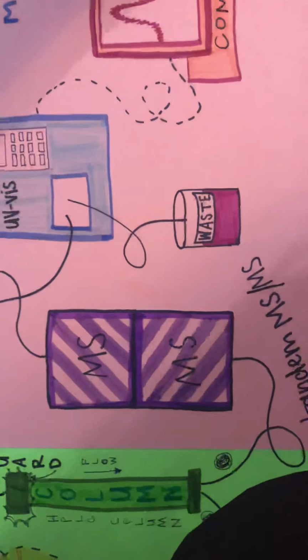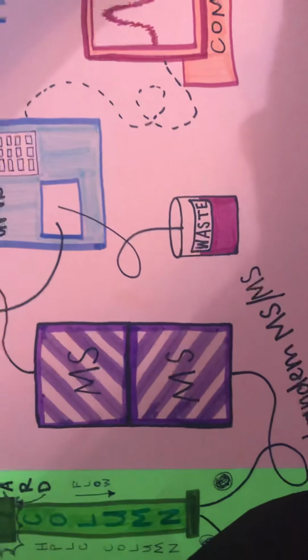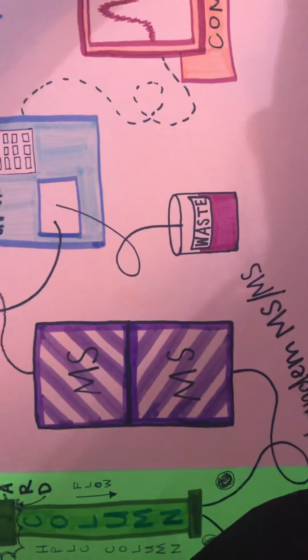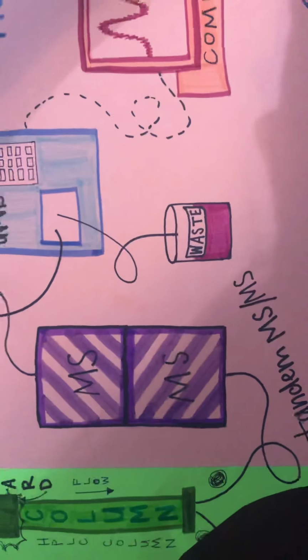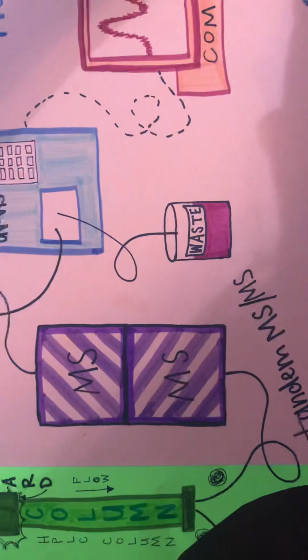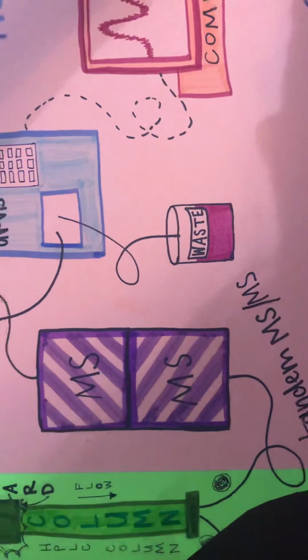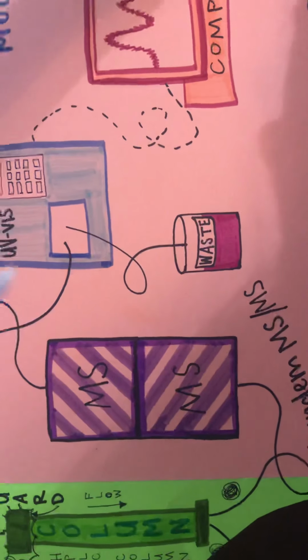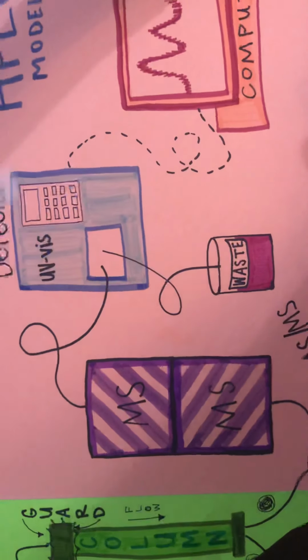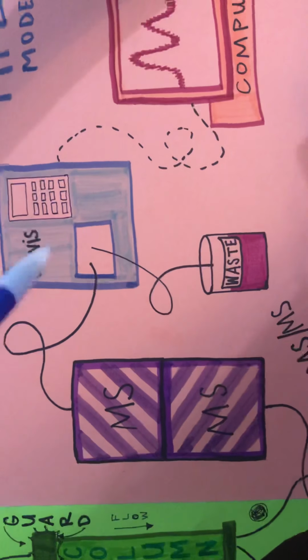And one thing that we need to make sure happens is that our analytes and our solvents are absorbing at the same wavelength. An advantage of UV vis is that it can target specific analytes and you can see when they come off. A disadvantage is that you need to make sure that both the analyte and the solvent have the same wavelength. If they don't, then we could get different peaks that are hidden behind one another, or you may only see the peak of your solvent or the peak of your analyte and not both. So you want to make sure that you have two distinctive peaks at the same wavelength.